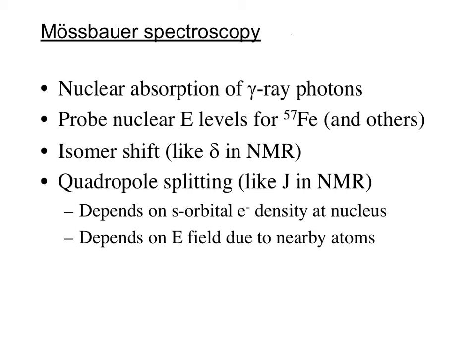All right, here we go. Week 4, Lesson 4, Mossbauer spectroscopy. This is a pretty specialized form of spectroscopy, but it's kind of cool and I like talking about it, so we're going to go through it pretty quickly and just give you a sense of some of the interesting different spectroscopies that are out there for the inorganic chemist to use.